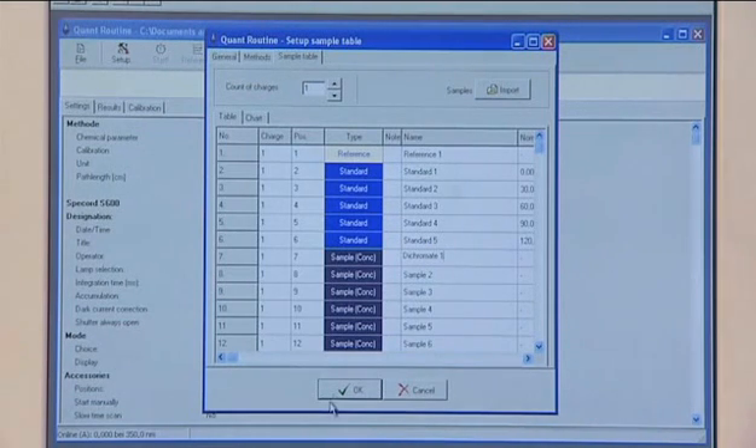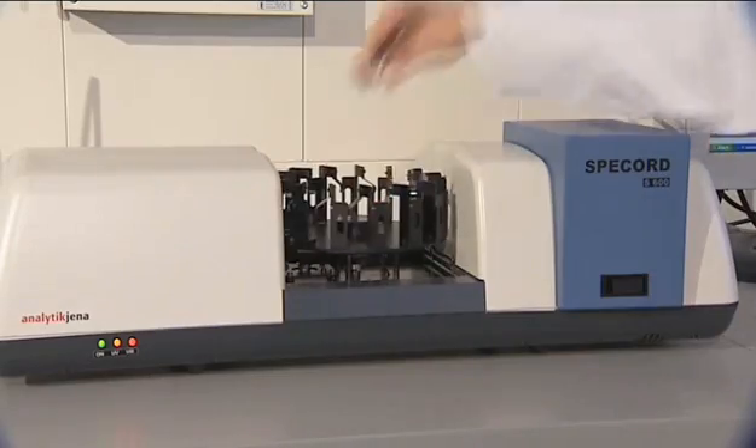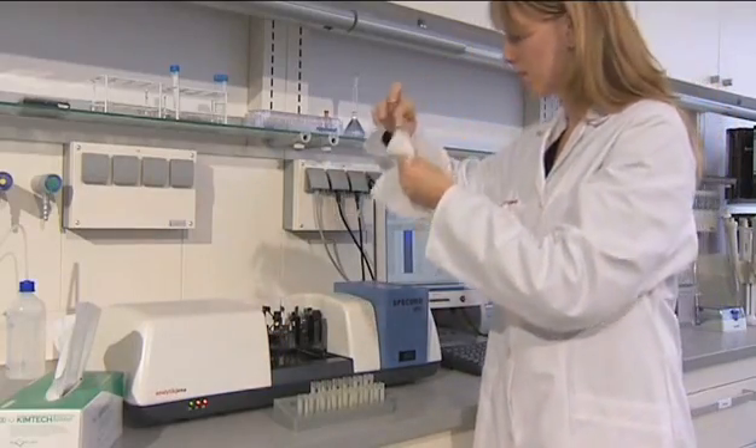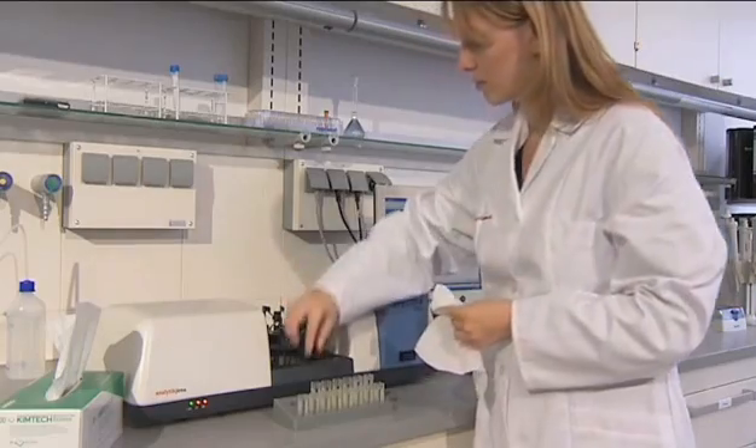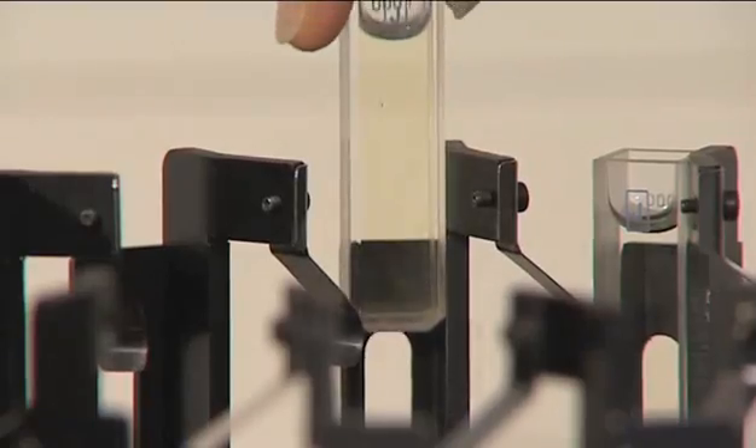Additional facilitations for routine applications are accessories for automation, like the sipper system or a cell changer for 8, 15 or 50 cells. The accessory is put onto the bars of the sample compartment, and the system is immediately ready for action.